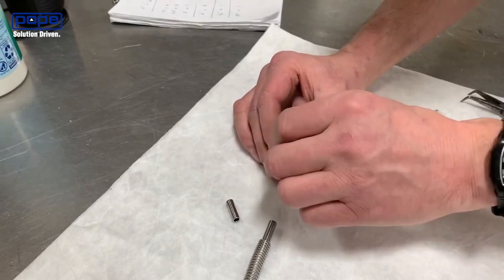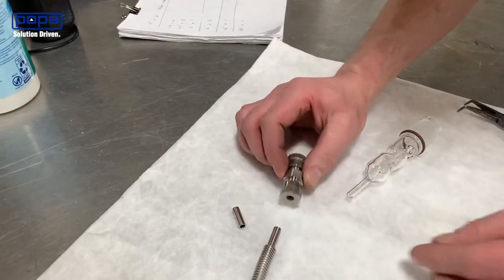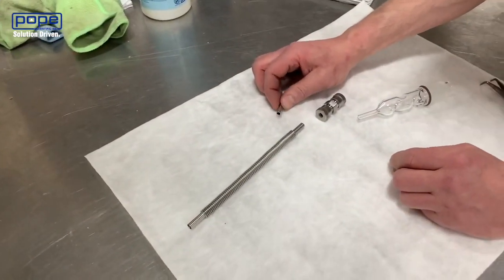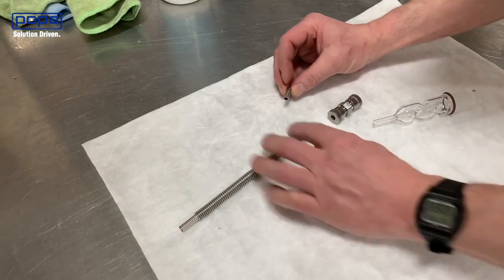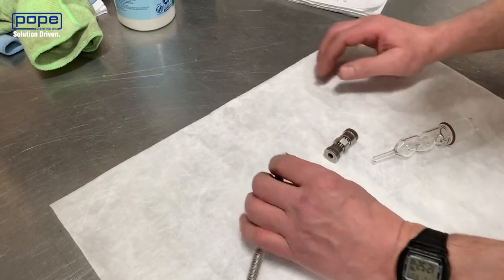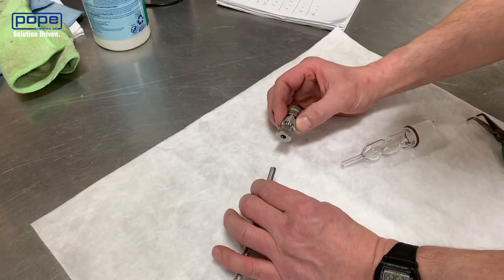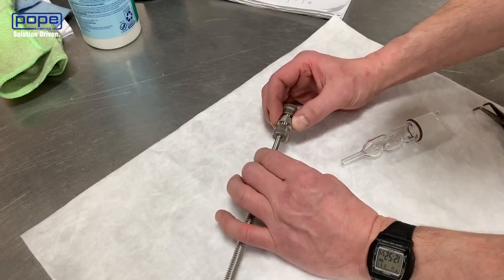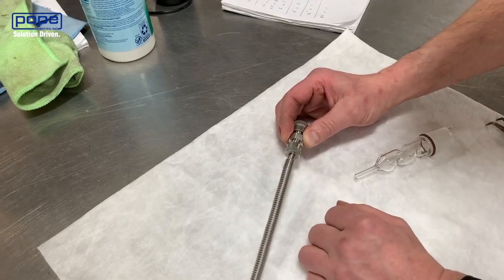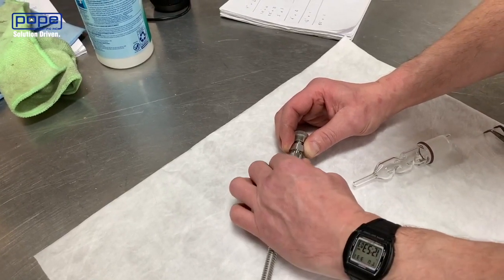Now put the cap on, keeping it pretty loose because otherwise the fitting won't go in — you don't even really need it hand tight. I would always recommend starting on the metal side. Put the insert in to protect the convoluted tubing from being crushed. Practice with this side because it's less likely you're going to break stainless steel than glass. Push it into the end of the fitting — it's going to stick a little bit, then use a little more force until you feel it pop past the o-ring. That's going to give you a good seal.